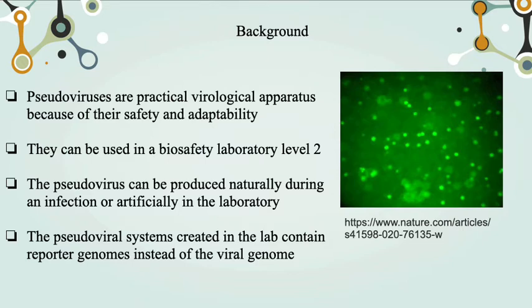They are safe because they are an alternative viral particle for highly pathogenic viruses. They are genetically stable and essentially safer than wild-type viruses. They can be used in a biosafety laboratory level 2, while the wild-type virus may require biosafety laboratory levels 3 or 4.